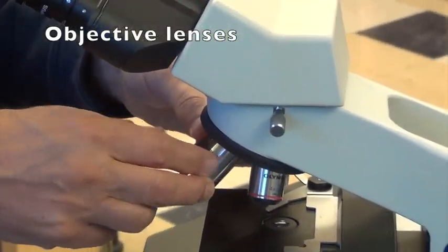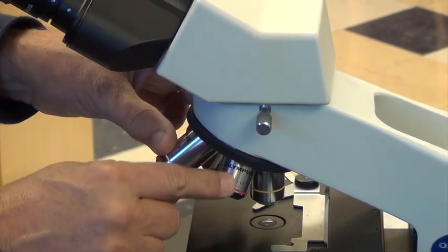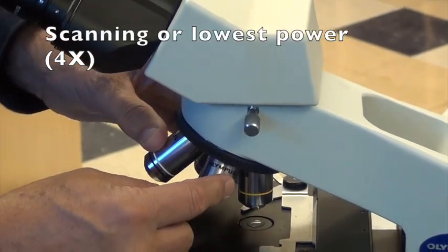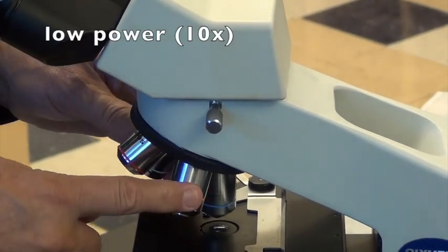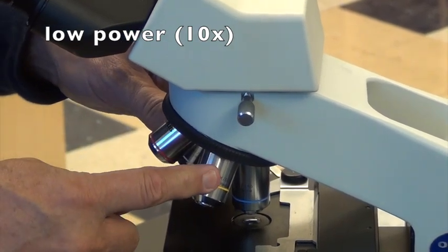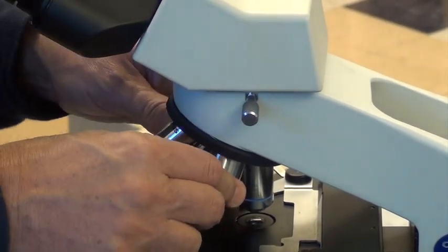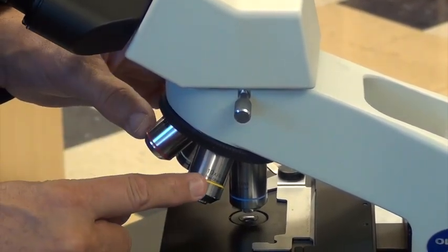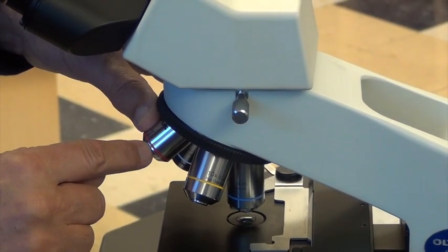I have four objective lenses — you may have three, two, or even one. If you see the shortest one and you have four, it's called a scanning objective and it's 4x by itself. The next one is the low power. I know that sounds funny because scanning is actually lower in power than low power, but my guess is that originally there was a low and a high, and as they added objectives they had to invent names. Low power is 10x. On my microscope they're color coded — yellow for low power 10x and red for scanning.